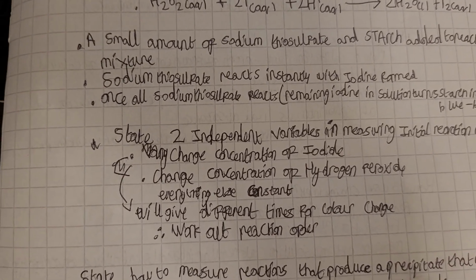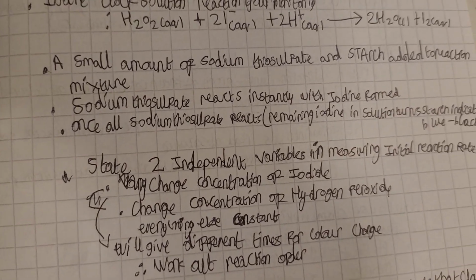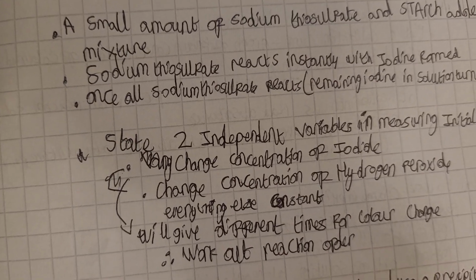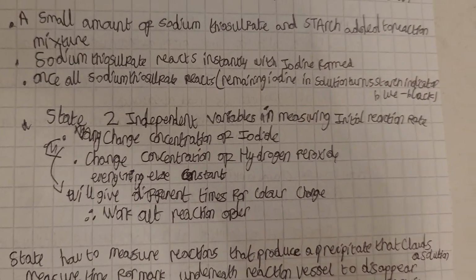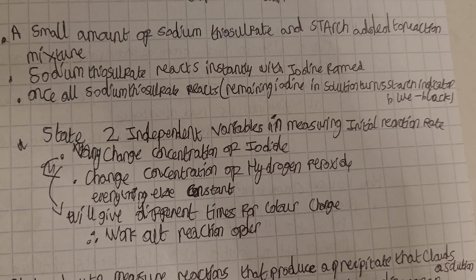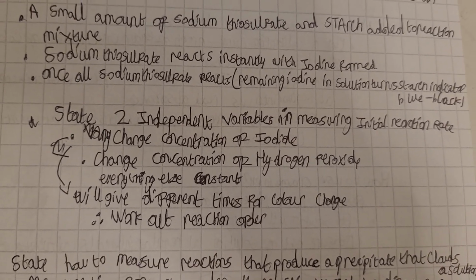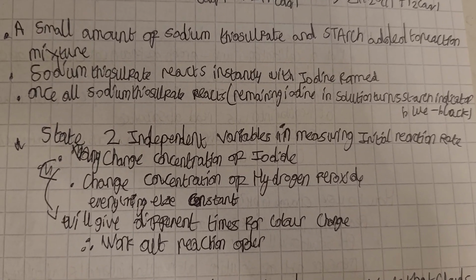The sodium thiosulfate reacts instantly with the iodine formed, and then once all the sodium thiosulfate has reacted, the remaining iodine in the solution will turn the starch indicator blue-black. And once you see that, you know the time has been reached.